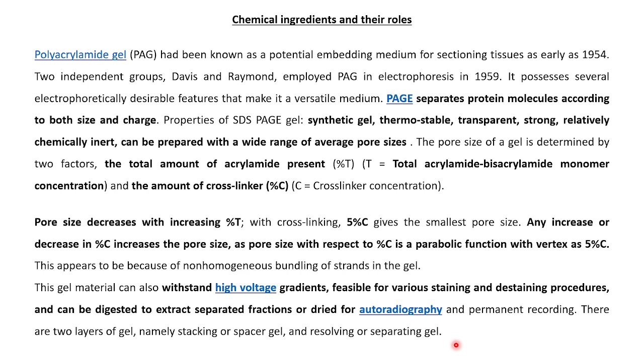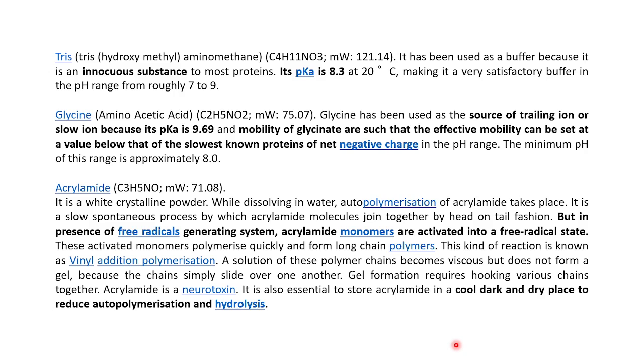And the SDS-PAGE has two layers of gel. One is the stacking gel, for the stacking of the protein fragments, and the other is the resolving or separating gel, for the separation of the molecules.